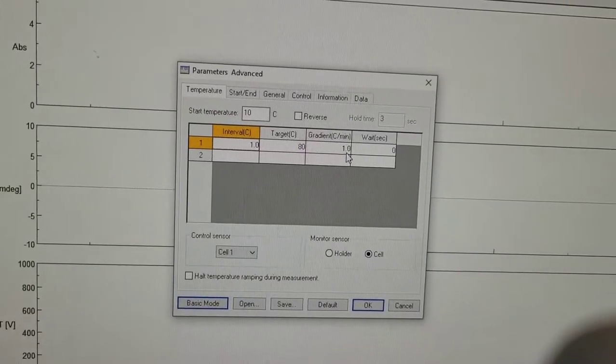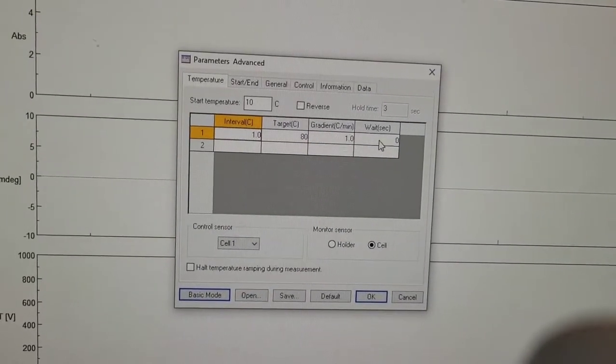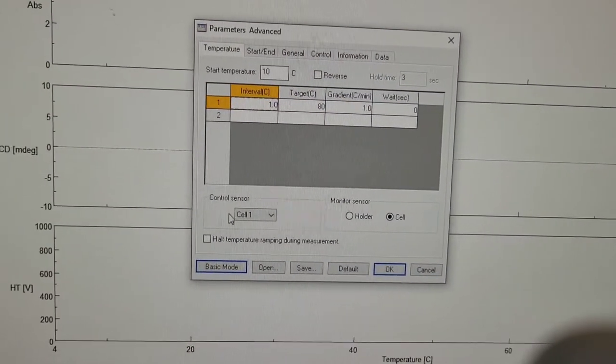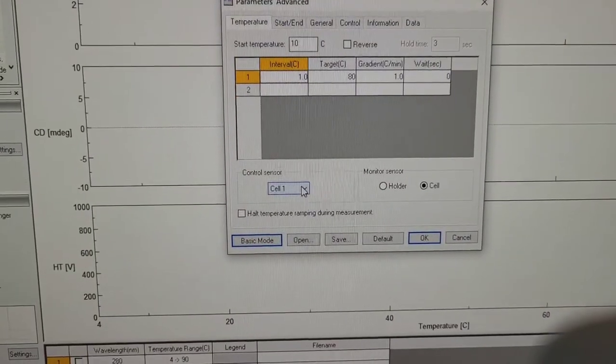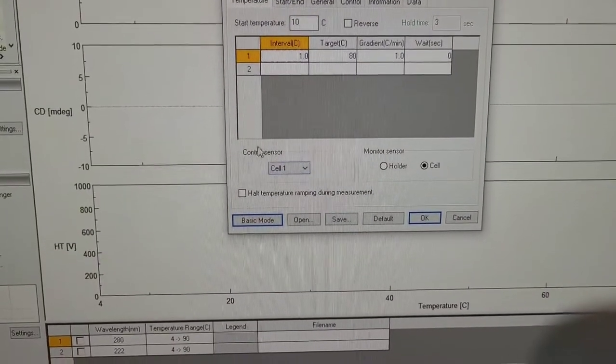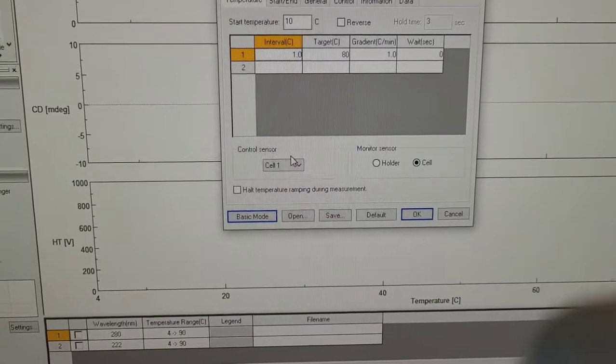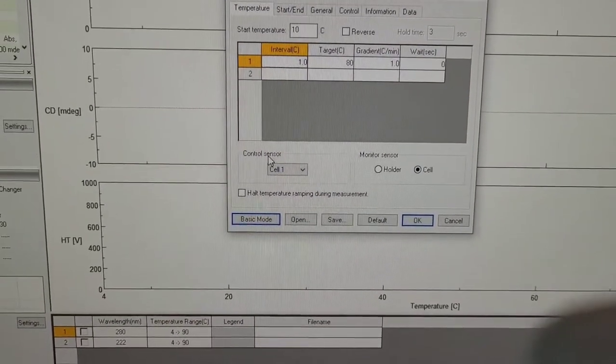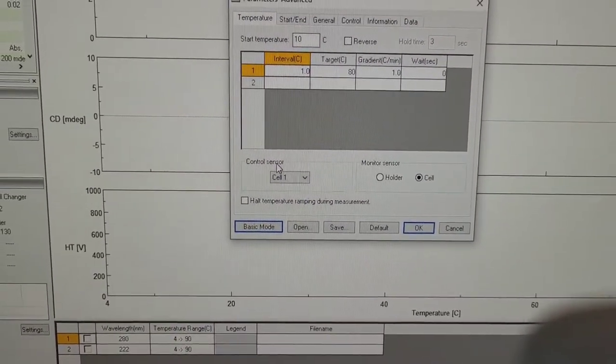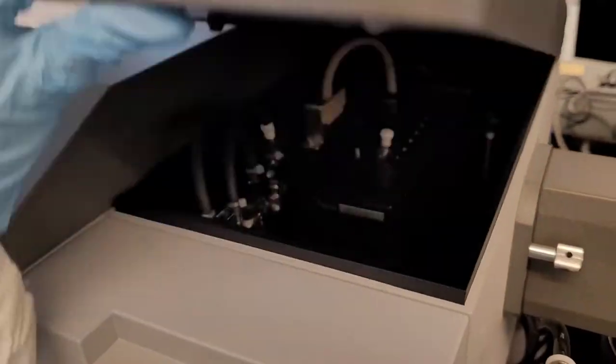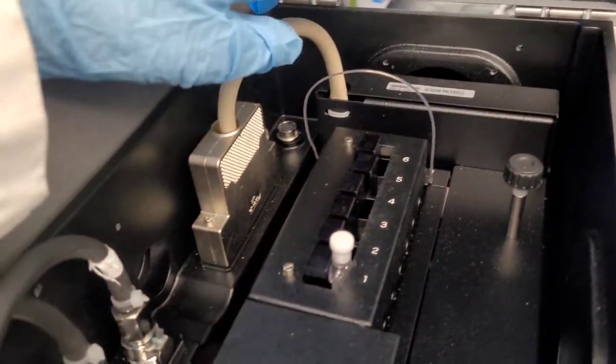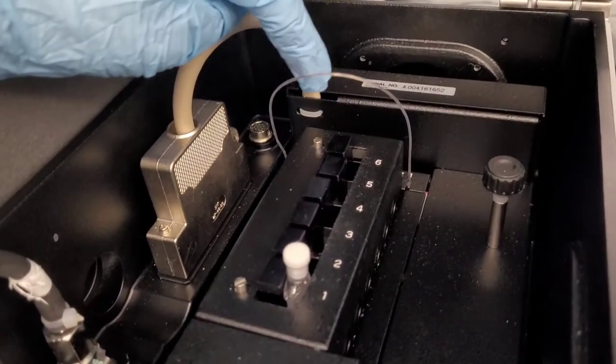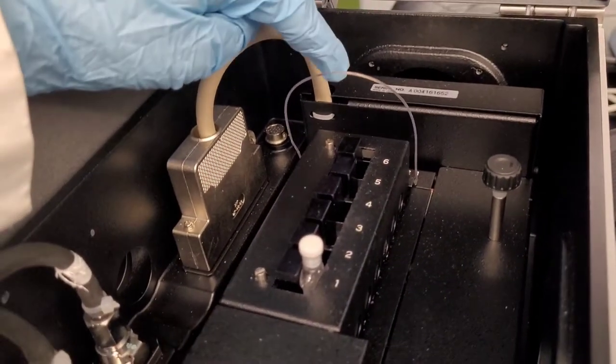So gradient per minute one, weight is zero, and control sensor is where you sense the temperature. So there's a little sensor in the sample holder that I will show you is this thing.